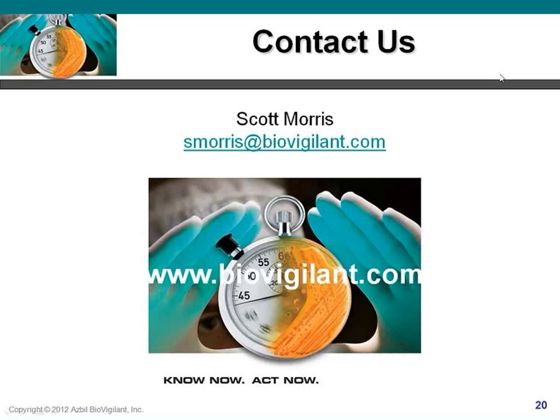So that often means placing the probe above where your product is exposed, but not too far above, because you want to capture anything that would otherwise be deposited onto a sample. But really that's almost an art that people in a manufacturing area often have specific guidelines for and already have a rough idea where they want to place it.